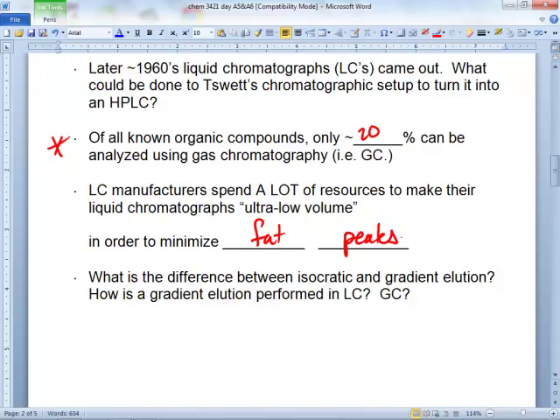There's two types of diffusion. Eddy and longitudinal. Okay, they both contribute to the Z, zone broadening. That's what goes in the blanks. Zone broadening. Okay.